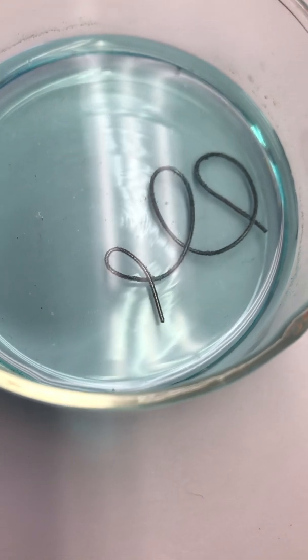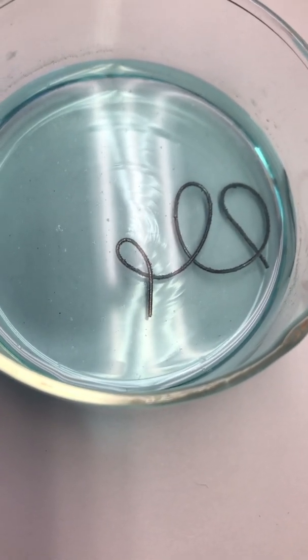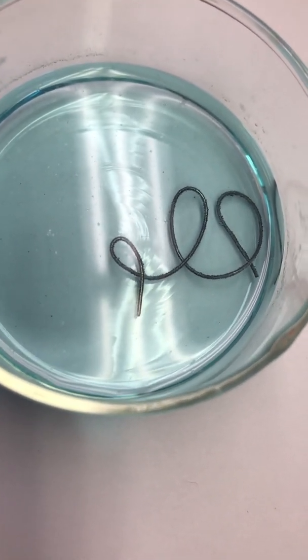Okay, so we're gonna let this sit, and then we're gonna come back and take a picture of it after some time has elapsed so that you can see what the solution looks like at the end.